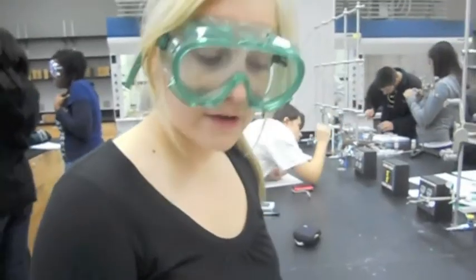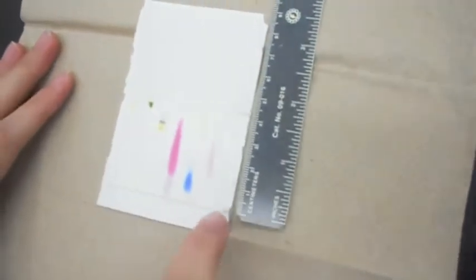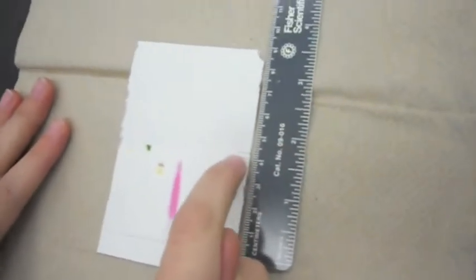So this has been in here for approximately 10 minutes. And now we're going to take it out and quickly measure the solvent line over at our workstation. After you take the TLC plate out of the solution, you're going to measure from the 1 centimeter line to where the solvent reached the top.